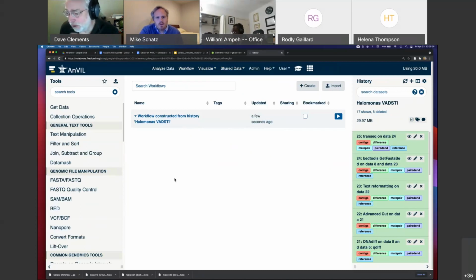But here, we could have run multiple, and then we could compare the contigs to see which one produced the fewest contigs, or there's a bunch of metrics you can run. We didn't do that today. I took Mike at his word, which, again, he's my boss, so always do that. No, but you're absolutely right. If we're going to do this for novel species, you often would try a few values.